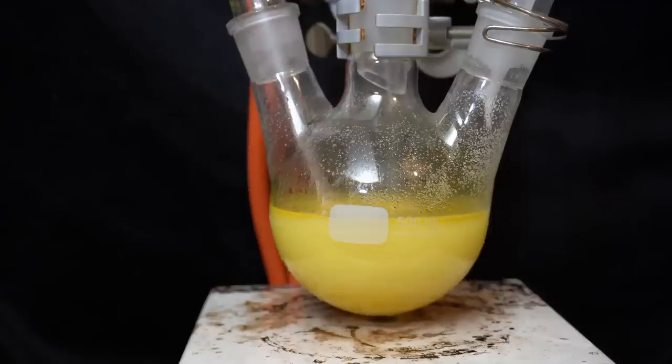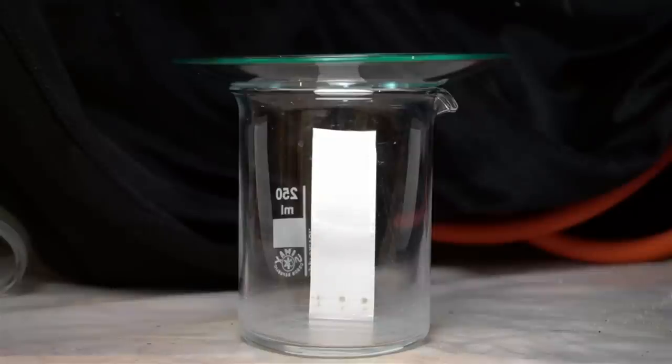After all the methyl iodide has been added, the mixture is allowed to stir overnight. The next day we can check up on the reaction progress by performing a TLC. On the left is a reference for aniline and on the right is our reaction mixture. Under UV light we can see four distinct spots from the reaction mix.